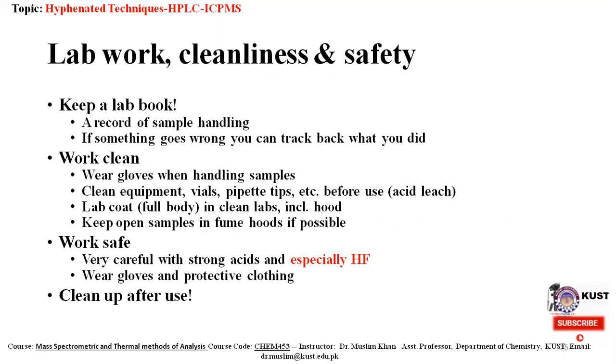Then lab work, cleanliness and safety. Keep a lab book, a record of sample handling. If something goes wrong, you can track back what you did, because you have to analyze yourself as well, what I have done wrong during the experiment. And work clean. Wear gloves when handling samples. Clean equipment, vials, pipettes, tips, etc. before use. Acid leach is best.